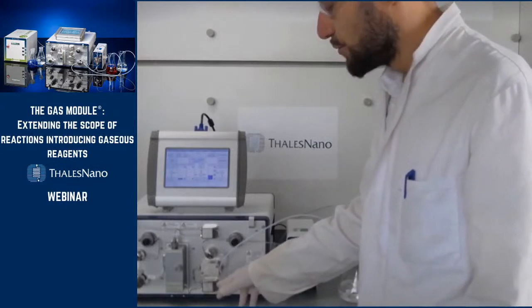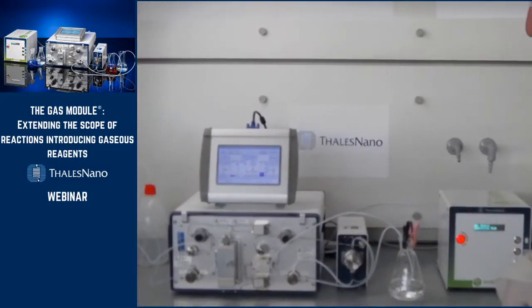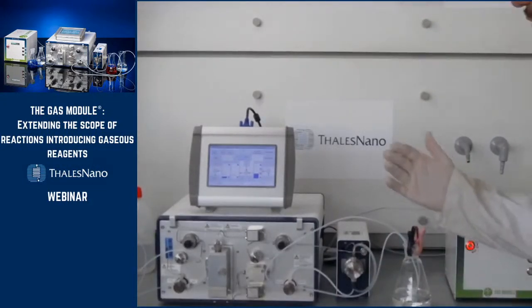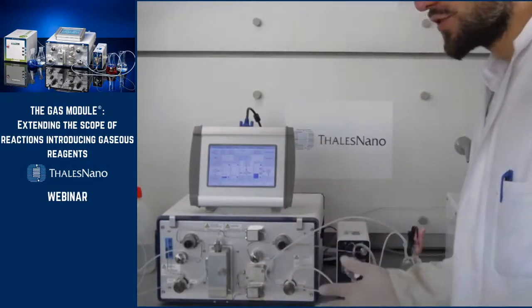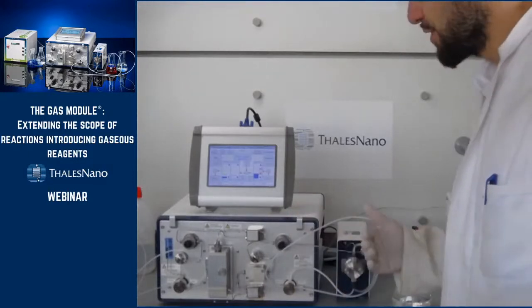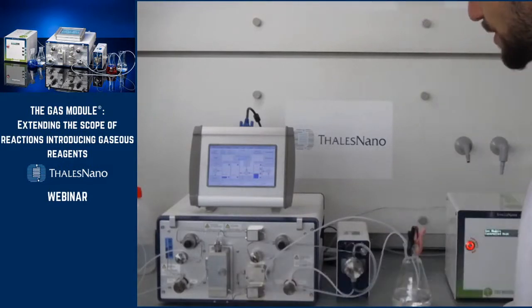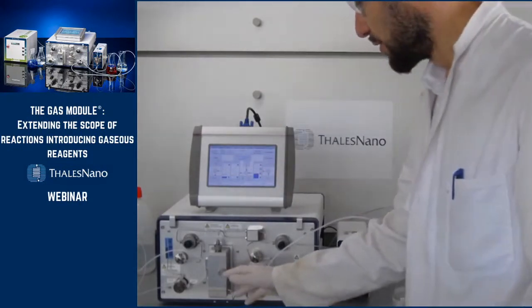Then it goes to a first connection point here. This connection point allows you to bypass the heater, for example, if you want to do a reaction at 300 degrees. You would need to put another heater, like the Phoenix flow reactor, and you can use this connection point to bypass this heater. It goes to the Phoenix flow reactor and comes back later here.